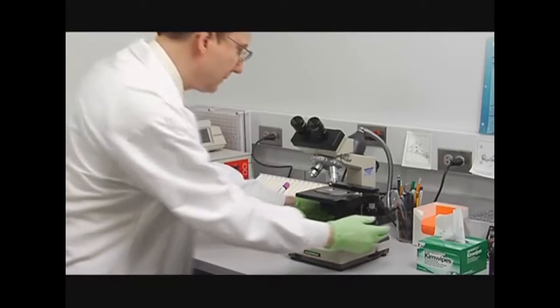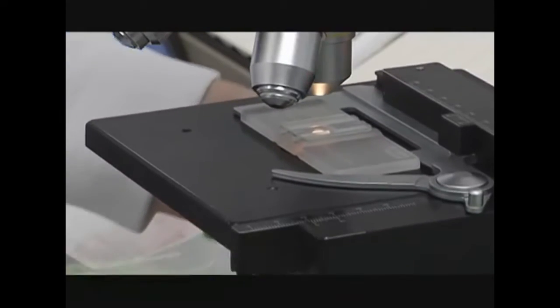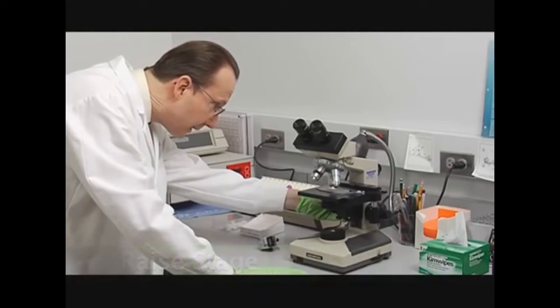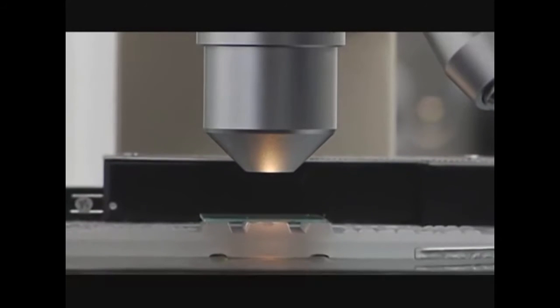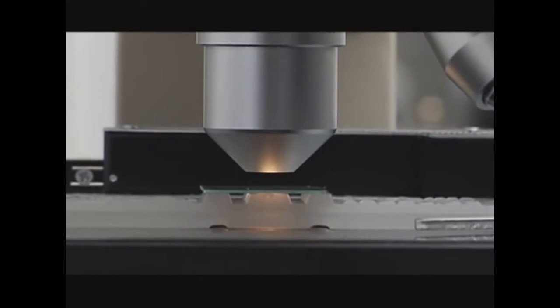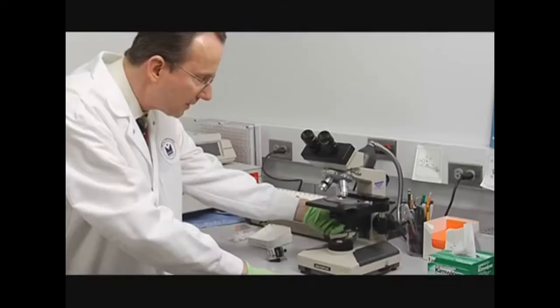Then you're going to raise the stage so it's about this far. You should have your 10x objective in place, and raise it till it's just about this close to your 10x objective. Don't bring it up too far. You may break your cover slip.